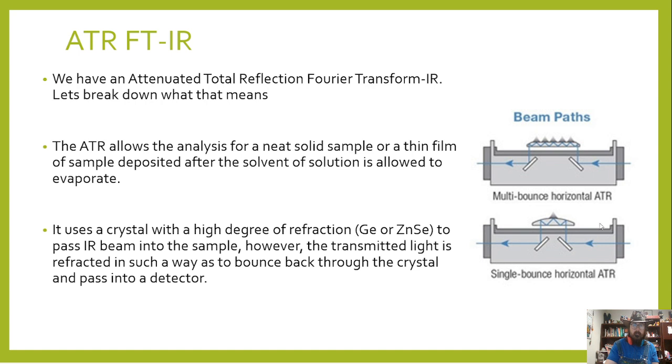Either way, we're having multiple bounces into the sample, or even just one bounce into the sample, but the light is basically refracted from the crystal into the sample. This way we avoid having to have some sort of solid that will absorb IR. It avoids the Nujol paste, and usually gets a much better detection.